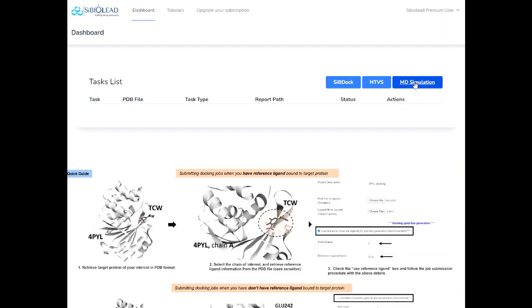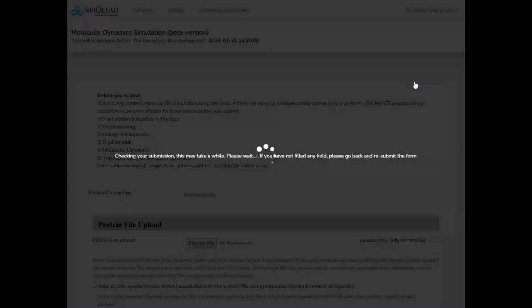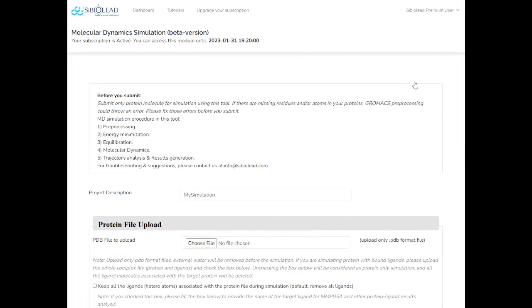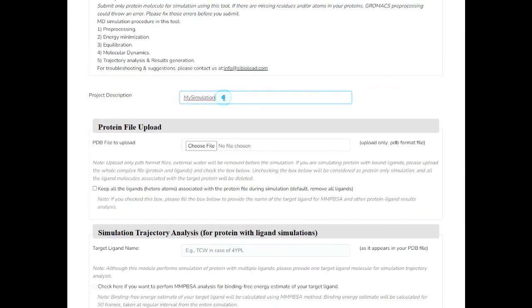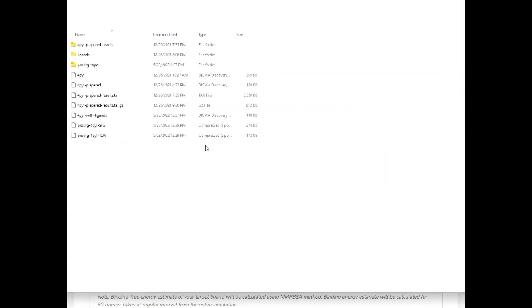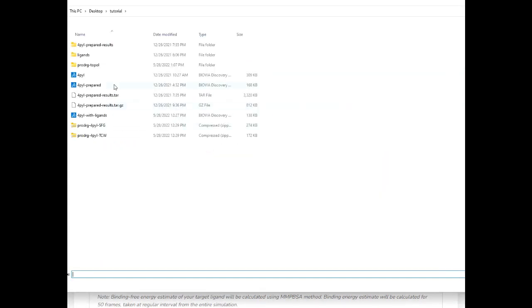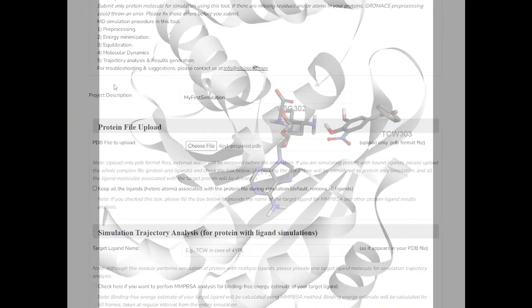Open the SI-BioLeads MD simulation submission page from your user account. Once you open the module, type your project name, then upload your target PDB file complexed with target ligand.